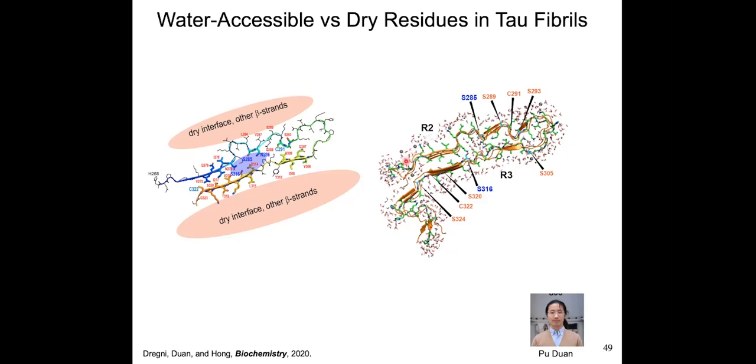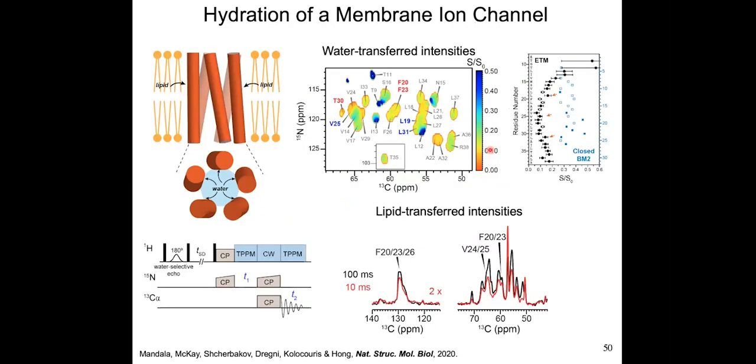We can give GROMACS the low resolution model of the backbone, and then let it find out how much water can actually permeate into this fold. And so these red balls are showing the water oxygens, and you get a sense that there is some water inside this beta arch.